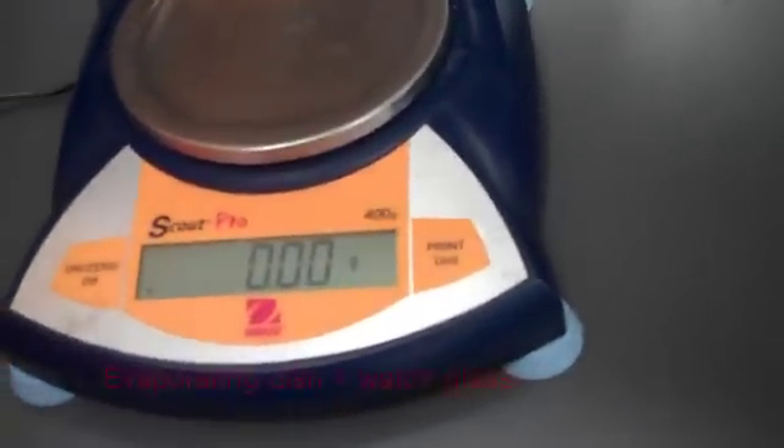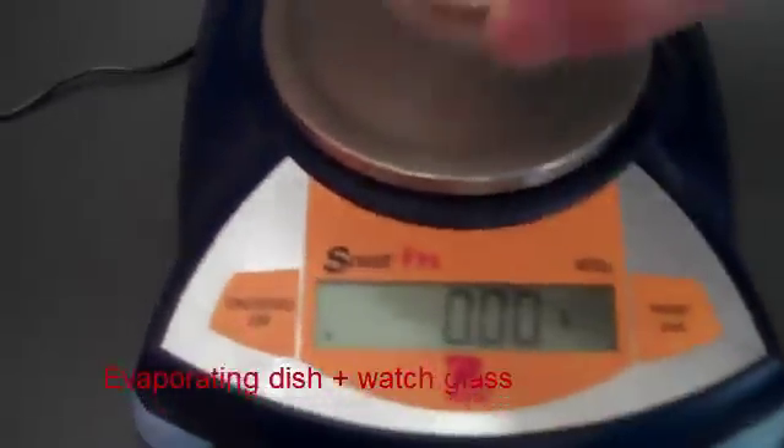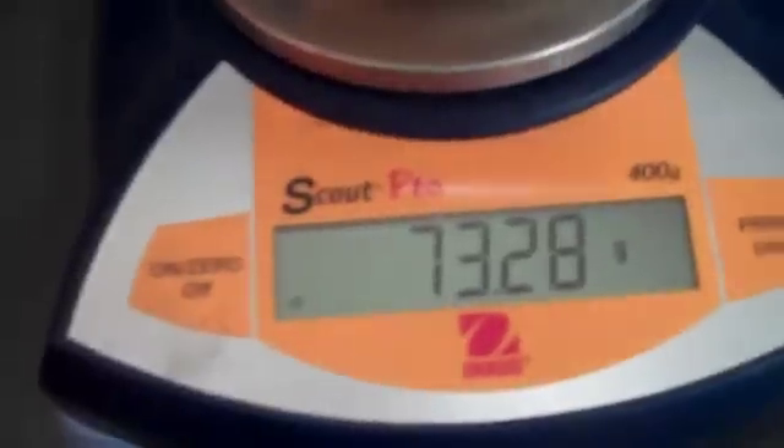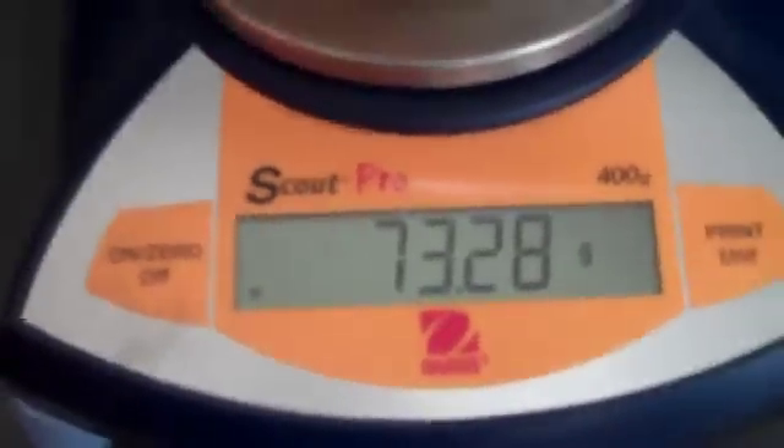Step one is to find the combined mass of the evaporating dish plus the watch glass. Here's the dish and here's the watch glass, and the combined mass is 73.28 grams.